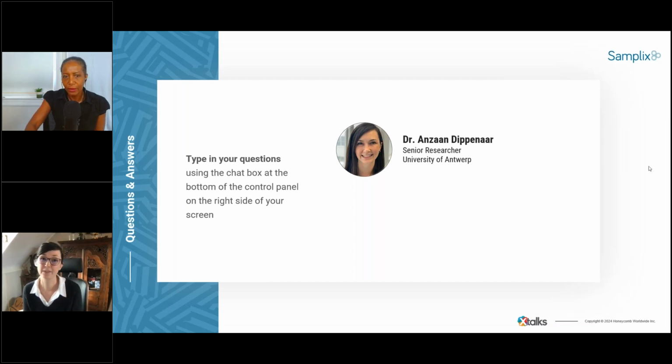Yeah, correct. So that's indeed our next step, to move towards clinical samples. We haven't yet done it on sputum or sediments or early positive cultures.